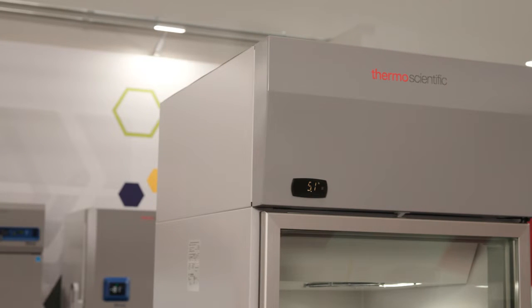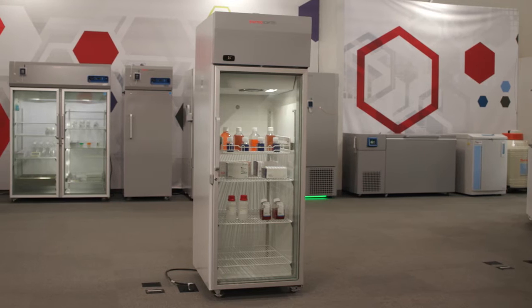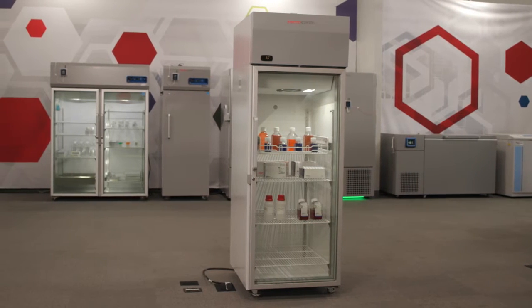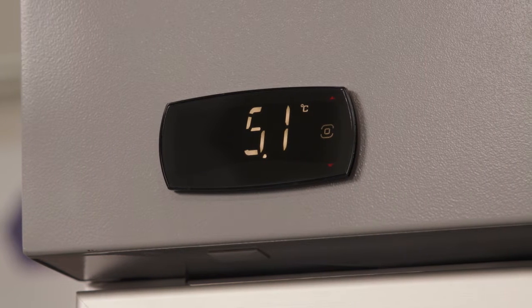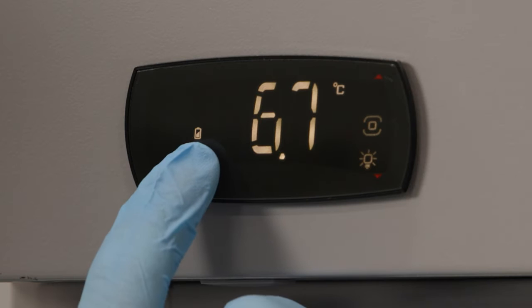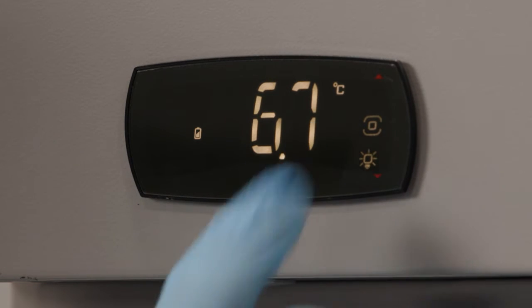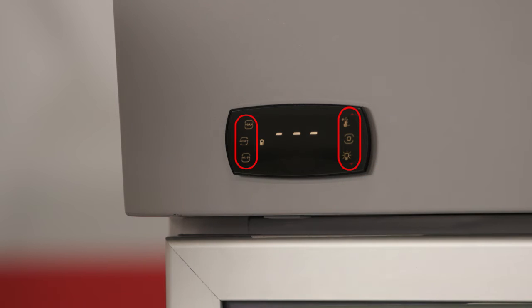Learn about the controller and settings for your new Thermo Scientific TSG Series refrigerator. The TSG Series controller user interface consists of three main components: the display, capacitive touch buttons on either side of the display, and icon fields between the display and the buttons.